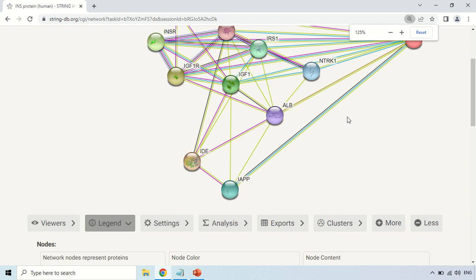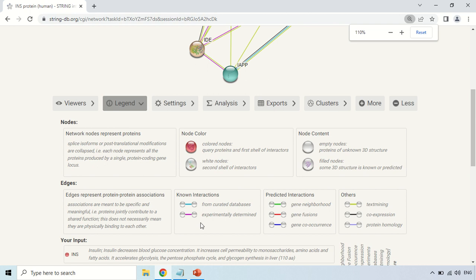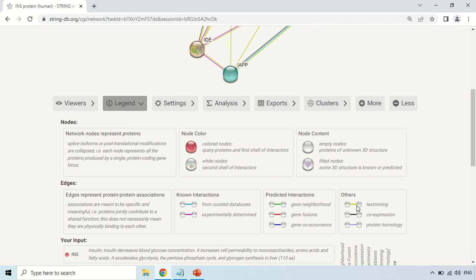Next are the lines — the color of each line carries meaning. If the line is blue, it means the interaction has been determined from curated databases. If the line is magenta, it means the interaction between these proteins was determined experimentally. If the line is green, it is from gene neighborhood. If the lines are red, the interaction is determined by gene fusion. If the lines are blue, interactions are determined by gene co-occurrence. If it is gold color, it means text mining — finding the interaction throughout the literature or publications.